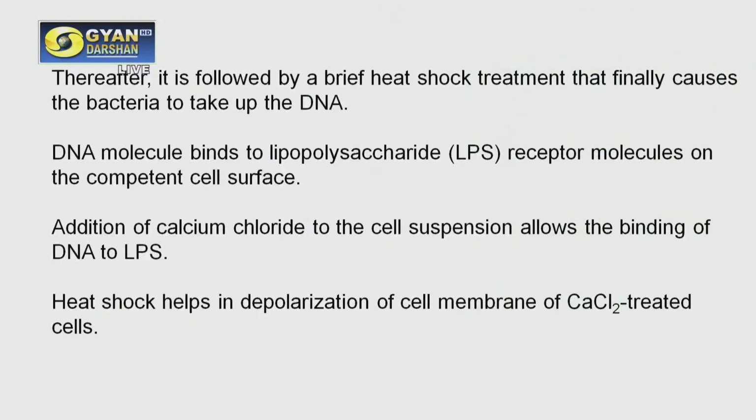And this brief heat shock actually creates depolarization of the cell membrane of calcium treated cells. So calcium treatment creates pores, followed by heat shock, which creates depolarization of the membrane, and altogether they facilitate the entry of the DNA molecule within the cell. So if that principle is clear in your mind, then we can go for the protocol or the procedure part. That is, how will you undergo the experiment now in the laboratory?